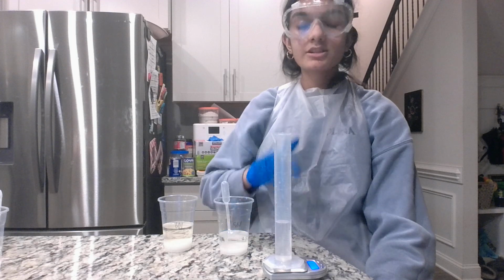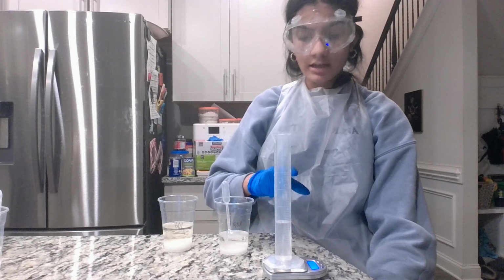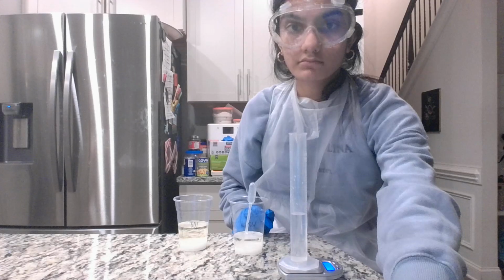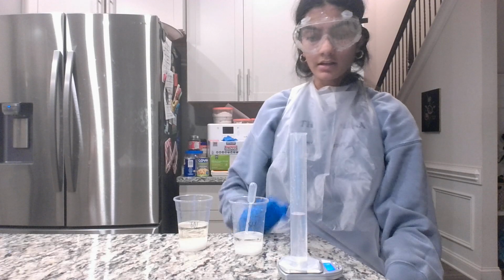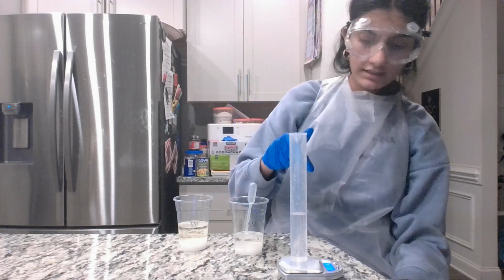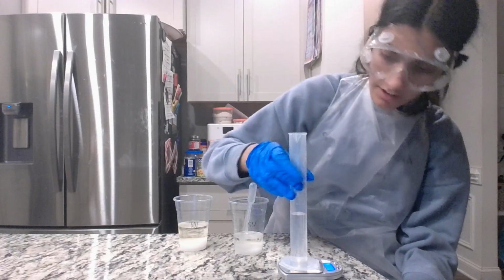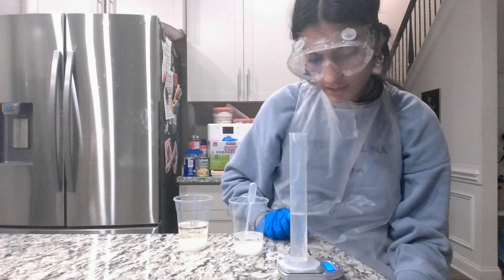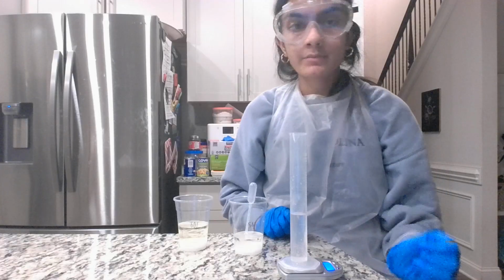This is 20 milliliters, and it weighs about 53.73 grams. This is 25 milliliters, and it weighs about 59.33 grams.